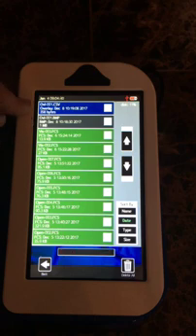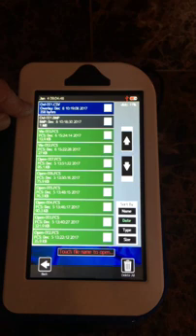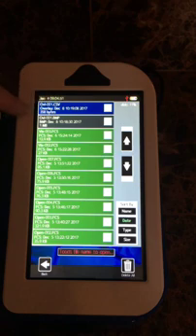When you're looking at assays in which you need to compare a control to a treated sample, we have incorporated an overlay application, and we save that data as a CSV.